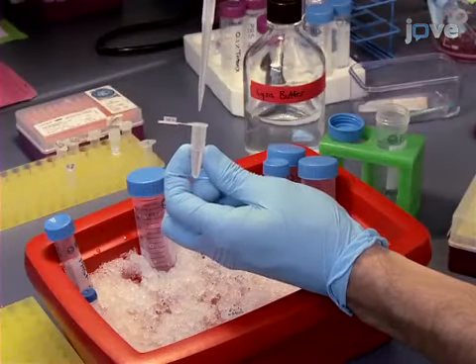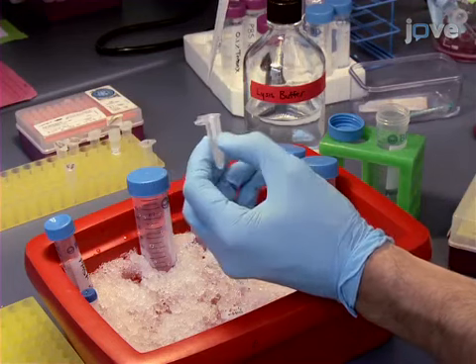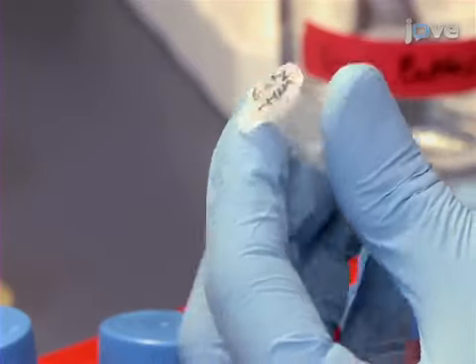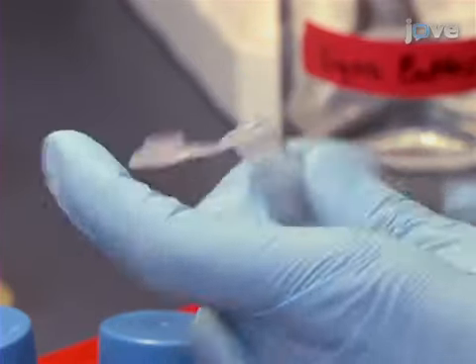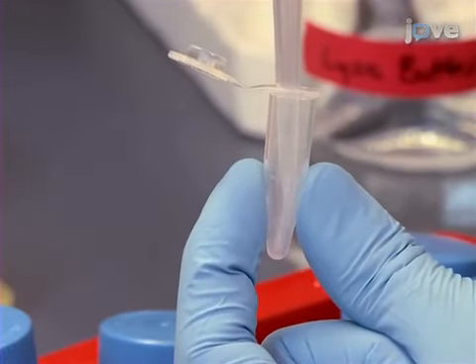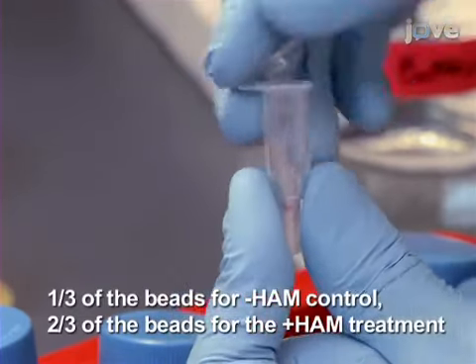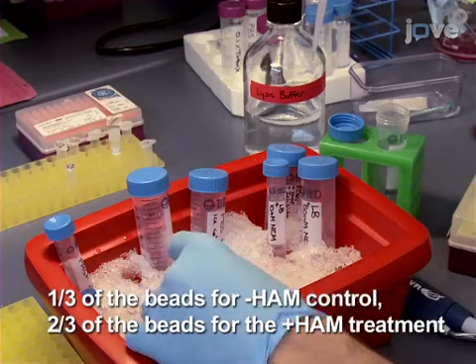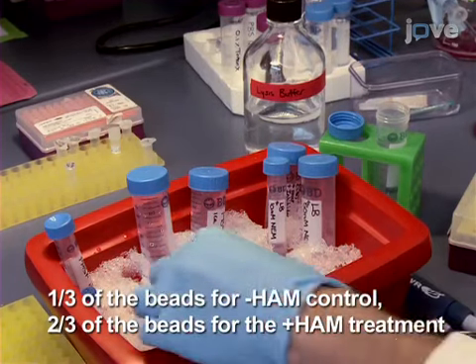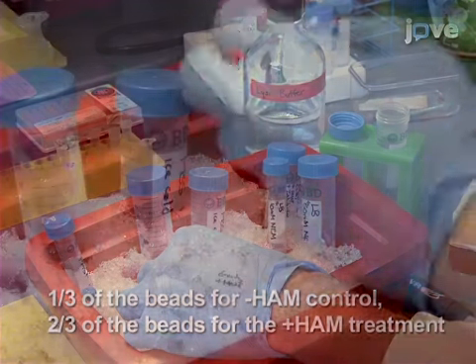After resuspending all of the sample beads, immediately collect 200 microliters of the sample's lysate bead slurry and discharge into that sample's -HAM tube on ice, leaving 400 microliters of each sample's lysate bead slurry in the tube for the +HAM sample. This is to account for the limited degradation of the target protein caused by HAM treatment. 1/3 of the beads are used for the -HAM treatment, and the remaining 2/3 are used for the +HAM treatment.